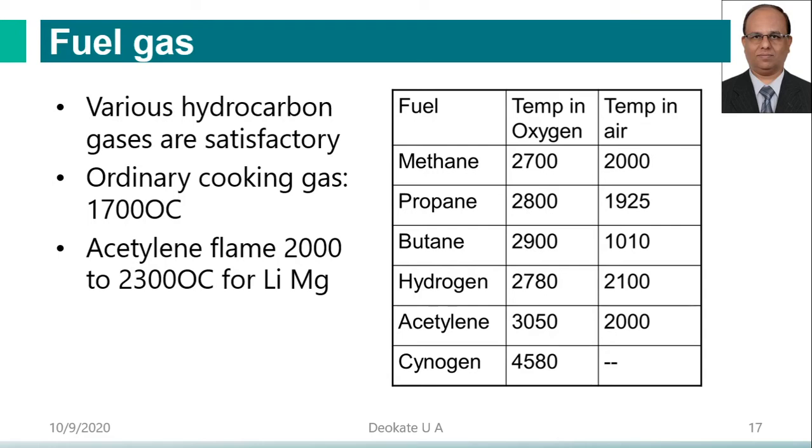The temperature is very high. Okay, so he can increase oxygen, and that can also be used to cut the metals. Okay, so that is due to the high temperature. Okay, so this thing you may have seen in the laboratory also. You may have used the acetylene air admixture for sealing of the ampoules, glass ampoules. You can seal these glass ampoules using acetylene oxygen air mixtures.